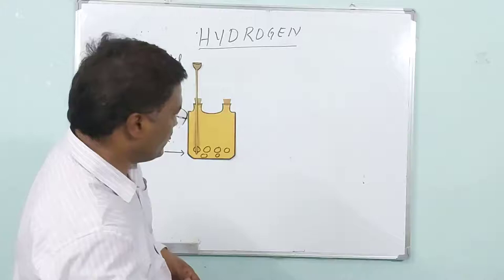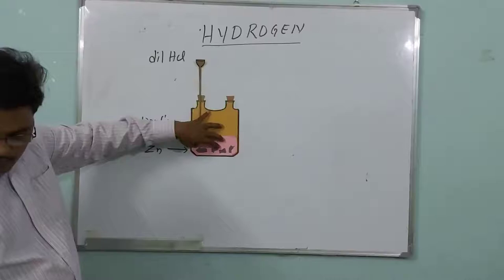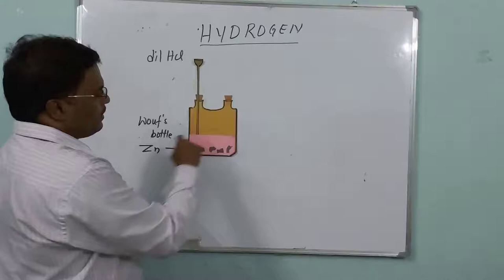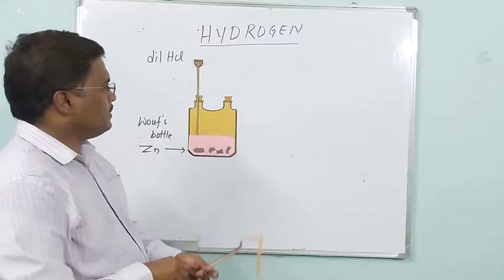Pour dilute hydrochloric acid until it dips. I have poured acid inside this. These are the zinc pieces and this pink one is the dilute hydrochloric acid.